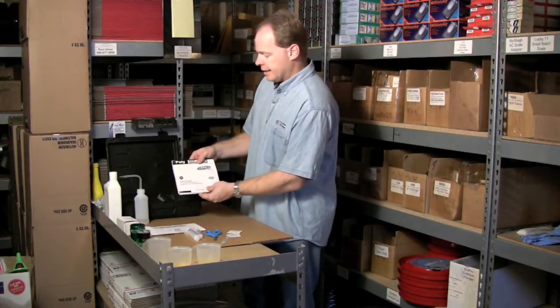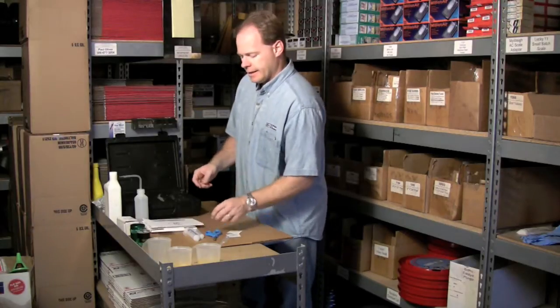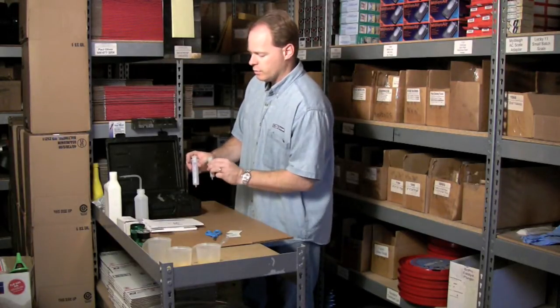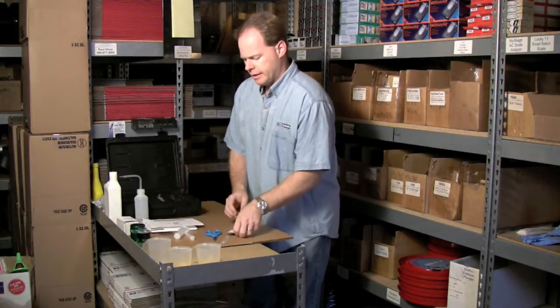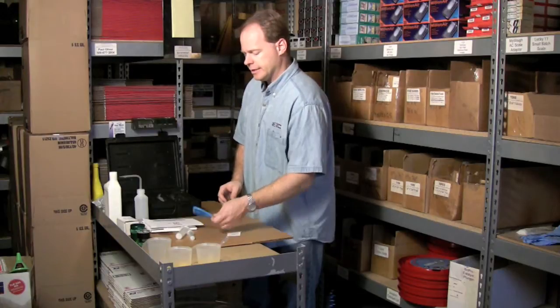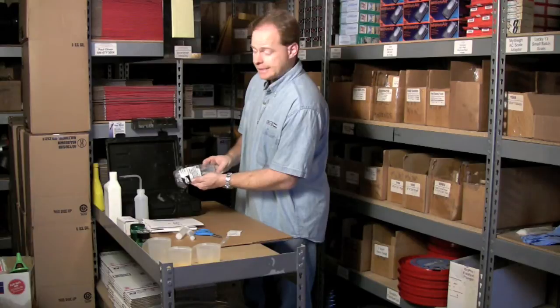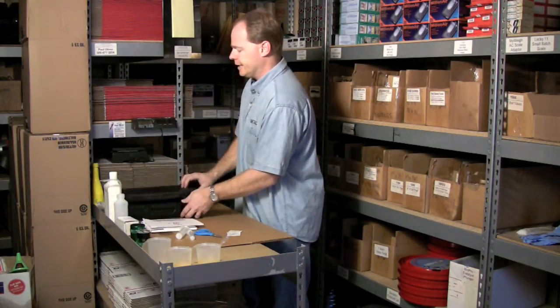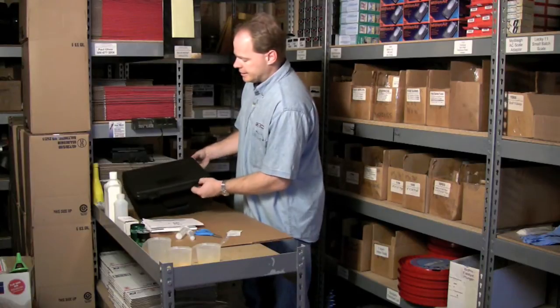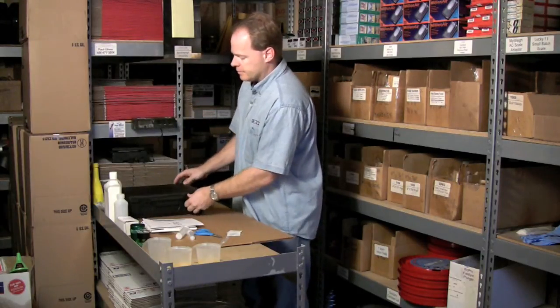It also comes with gloves, a full instruction kit, and two syringes — one for your sample and one for the solvent. And it comes with the calcium hydride and some scissors to cut that open, plus a pair of safety glasses. You can also purchase additionally a handy carrying case — it's just a poly case that you can put everything in and seal up. So that's what we have here.